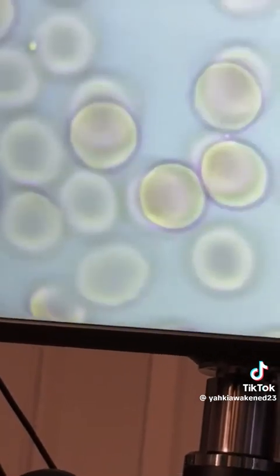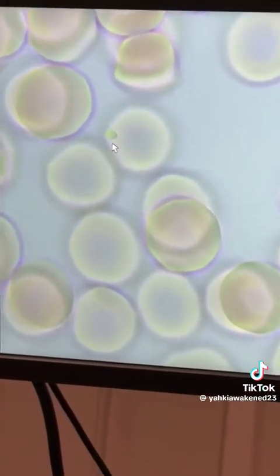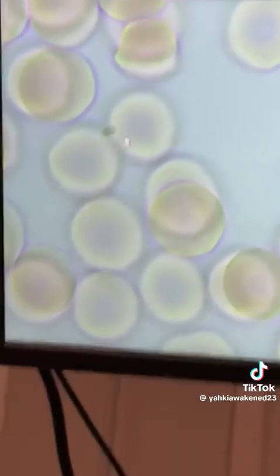There's one inside that one. Where is it? You seen it? I moved too fast. You see that one up here trying to get into the cell? Oh yeah, right there. I see it. Look at this one, y'all. God, he doing the same thing. Pleomorphizing, trying to make it inside of a cell.